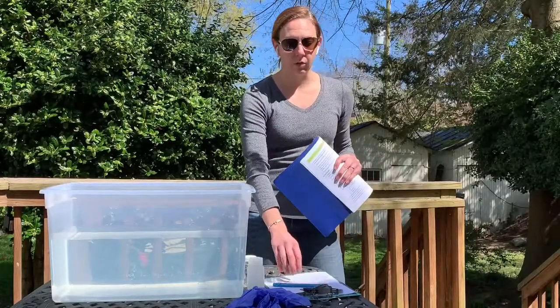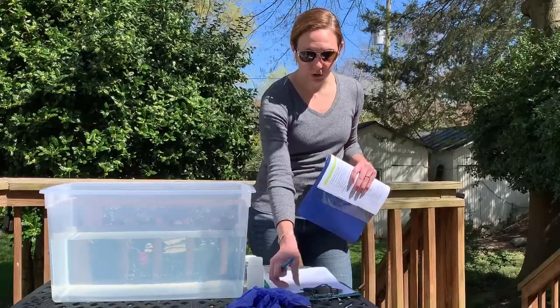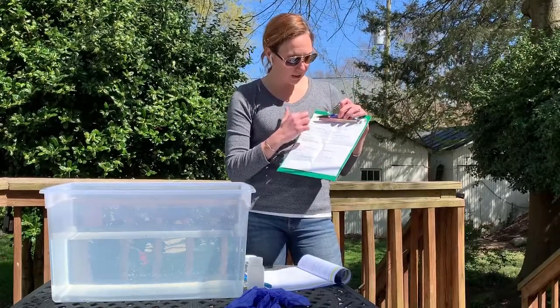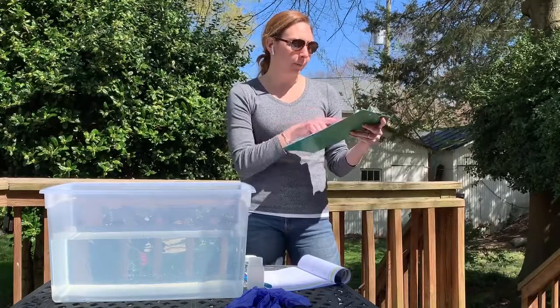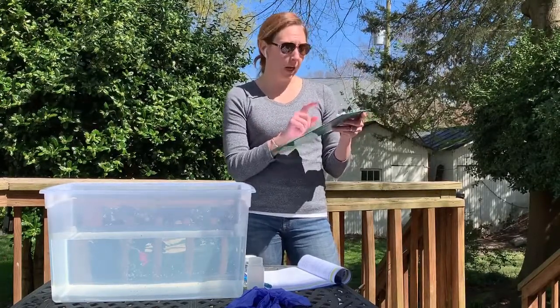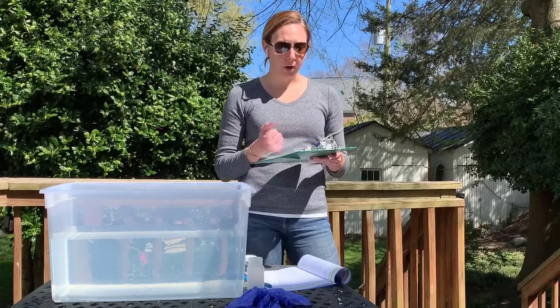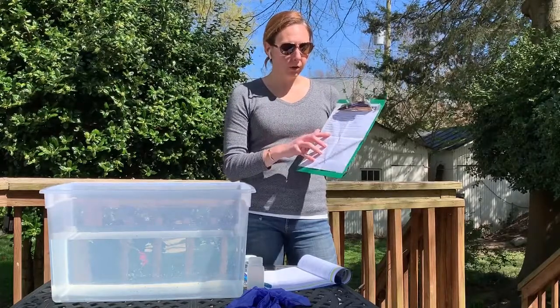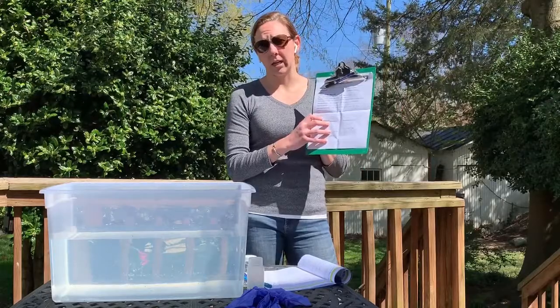While you're out in the field, you're going to want to record all of the information on the field data sheet and fill it out completely. This includes observational data like the weather, surface conditions, and things like that. You'll put the project name, your site information, the monitors out there with you, the monitoring date, and the time when you get to the site. Then you'll fill out the observational data: water surface condition (calm, ripple, waves, or white caps), stream flow rate, weather type, tidal stage, and a description of the water color. You can also indicate other observations like an oil slick, submerged aquatic vegetation, dead fish, or erosion. Include any rainfall that occurred within the last 48 hours of sampling. There's also a comments field for any additional notes about your site.